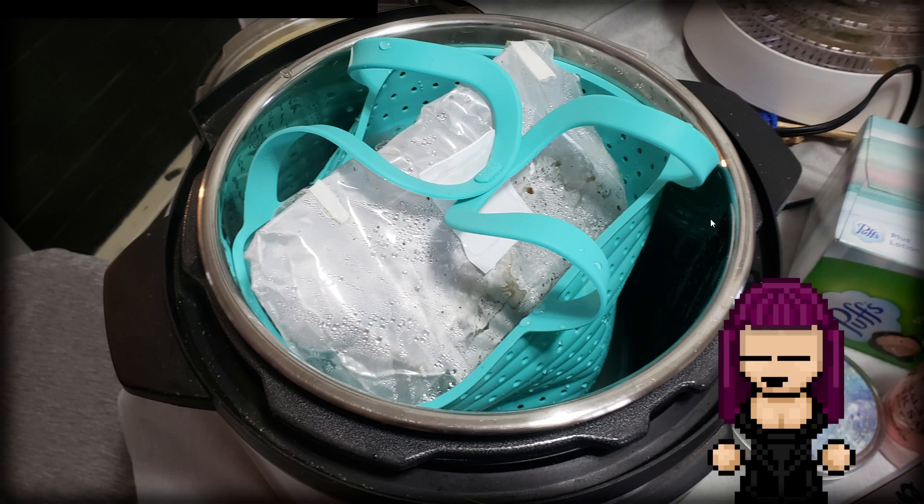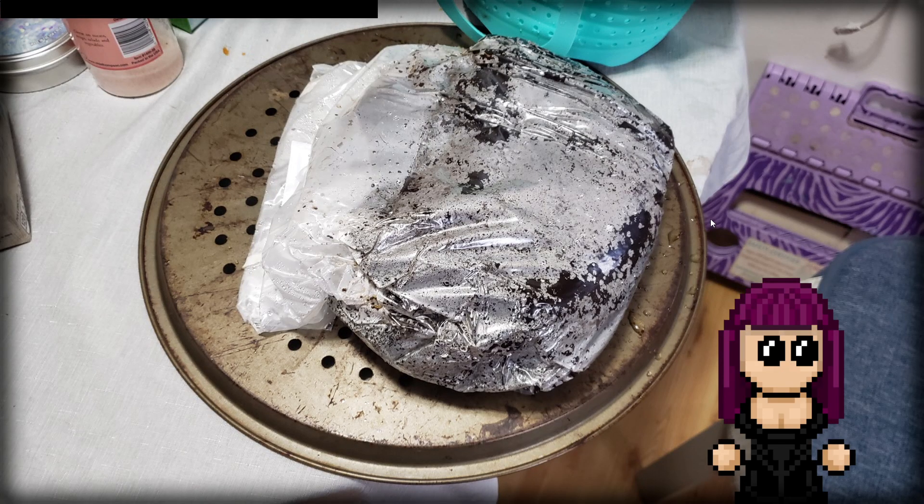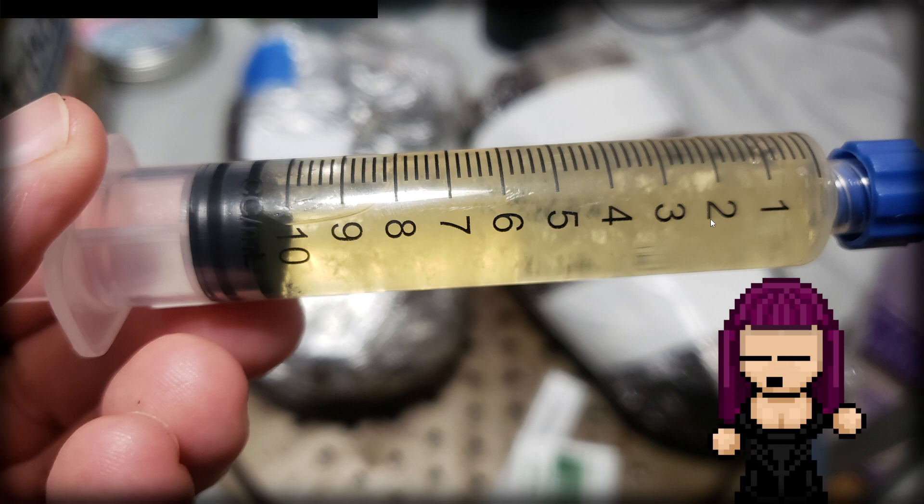Once the 60 minutes was done, I unplugged the instant pot to let it cool down and naturally depressurize before opening it up. The bag was a little inflated and moist, which could be a problem — we'll see if it's too moist as things develop. But there was no melting. Everything looked pretty great. I ended up doing two bags and let them cool. The bag felt a bit odd — almost inflated — but as it cooled down it went back to a normal feel and size.